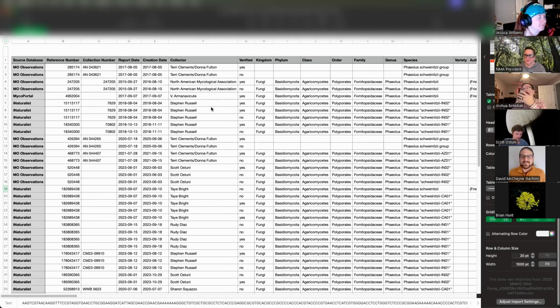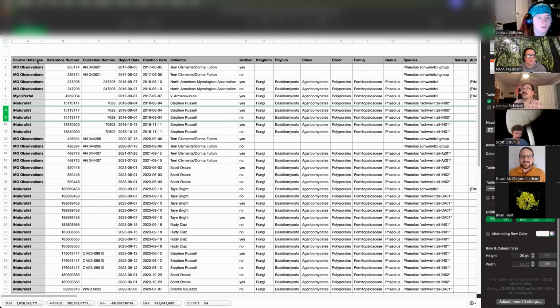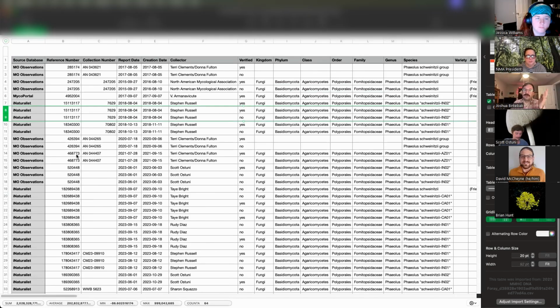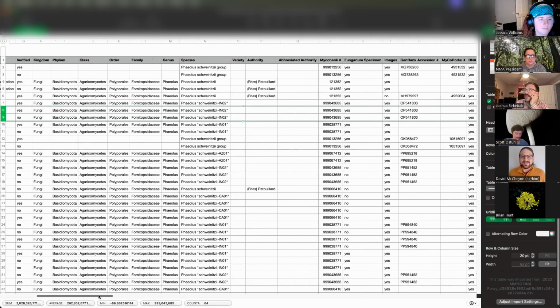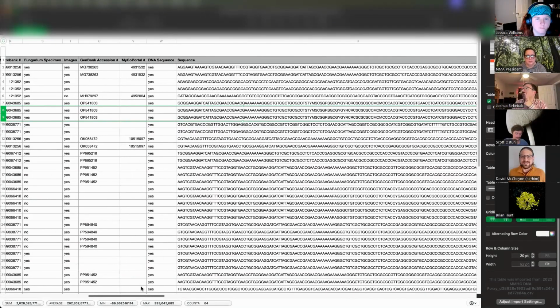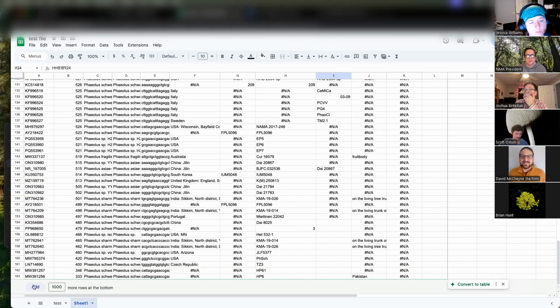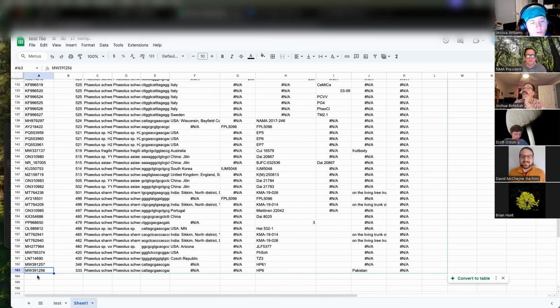It is just that we kind of end up with stuff like this where you go, okay, I'm literally just going to sort these, or even if it was long enough, just tell it to only report unique values. And then I could thin it out that way. So it works. I would just delete out those and then paste them into this spreadsheet to fit them in if I had 50 of them or something. And you could put a MycoMap number here or something.